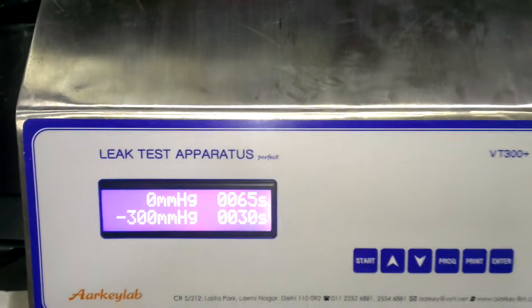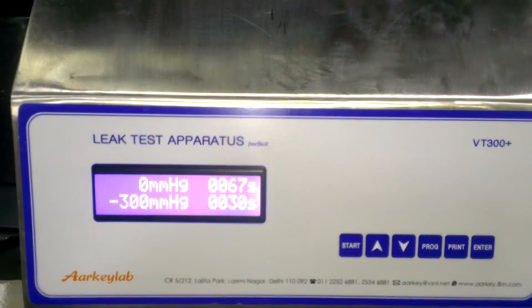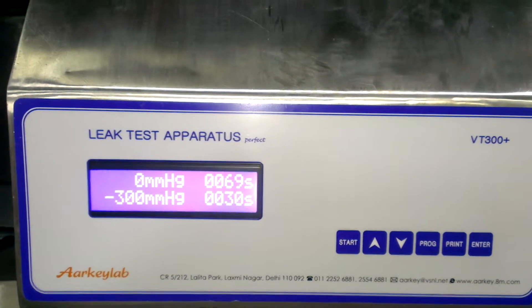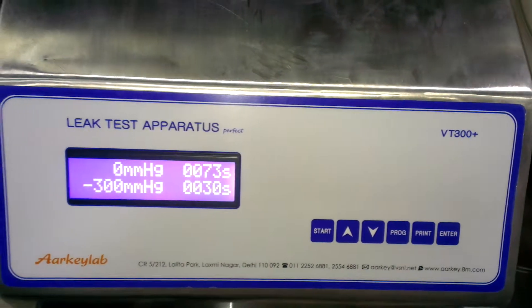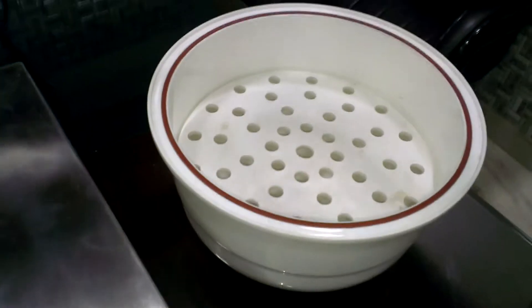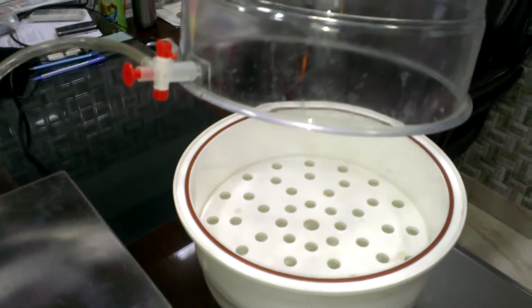The system is ready for the next test. The vacuum has dropped to zero.